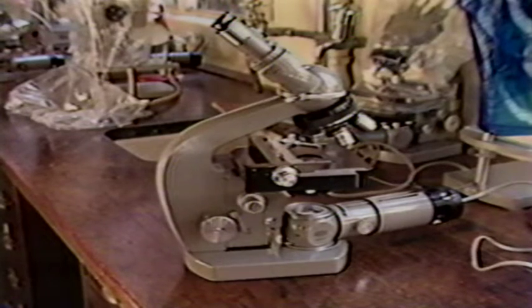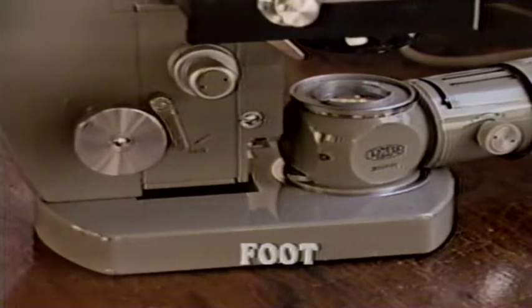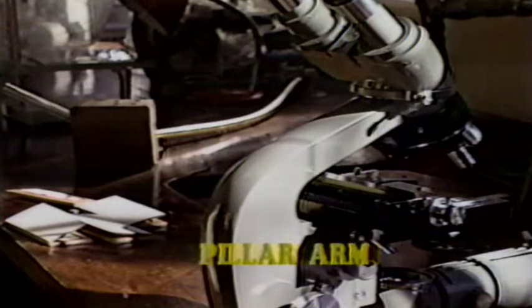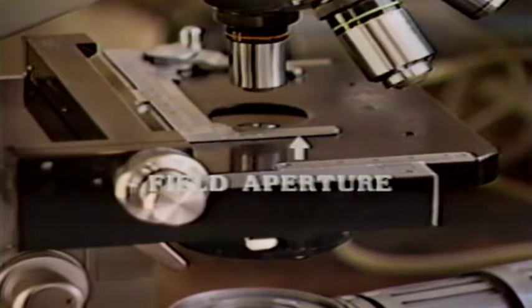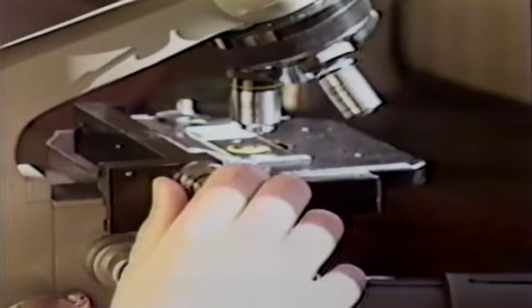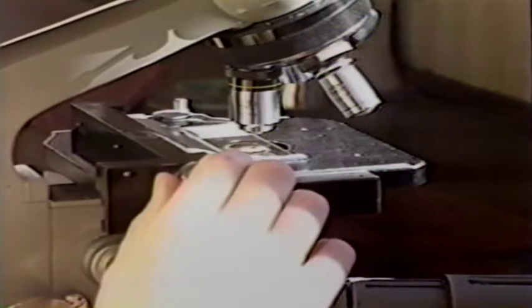Let us look at the most important mechanical elements of the compound microscope. First, the microscope stands on a large foot or base, which provides support for the instrument and is connected above to the pillar arm. Also above the base is a flat area called the stage, which contains an opening named the field aperture. Samples on glass slides rest on the stage and are held in place by stage clips. This microscope also has two slide positioning knobs, which are used to move the specimen around in the beam of light.